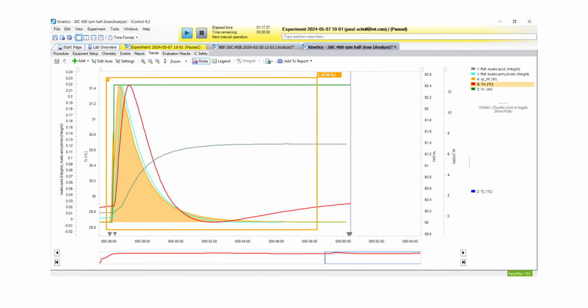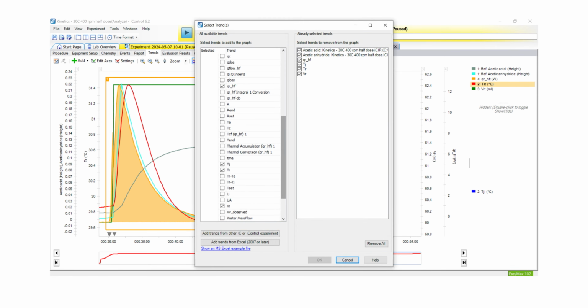Process parameter data like temperature of the reaction mass or stir speed is captured and recorded every 2 seconds. This data can be overlaid in the trend viewer as seen here for the hydrolysis of acetic anhydride. All process parameters of interest can be displayed by simply checking the boxes for the available parameters, as shown here.